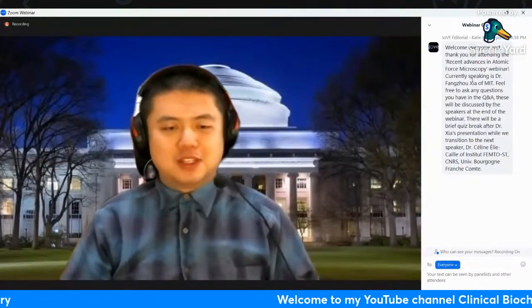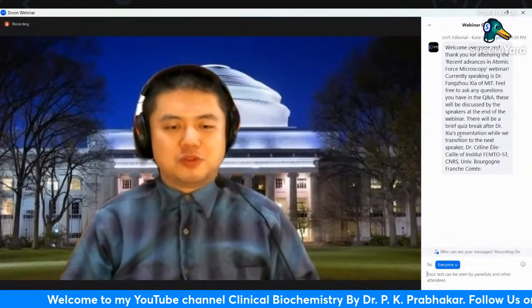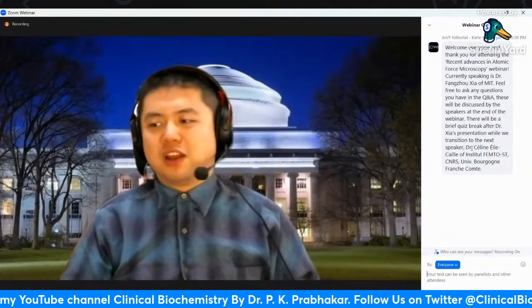Since I work with 2D materials a lot, first of all, if you're working with a really thin sample, then background removal will be very important. The sample tilt can easily cloud the judgment of contrast. For example, I'm looking at graphene, which is 0.35 nanometer thick. If you're looking at the monolayer and you have a sample tilt, then the contrast of that monolayer will be easily embedded into the entire tilt when you see the actual image. So when this happens, you want to remove it by some post-processing algorithm. This will include not only the tilt removal, but also some fitting due to scanner nonlinearity.